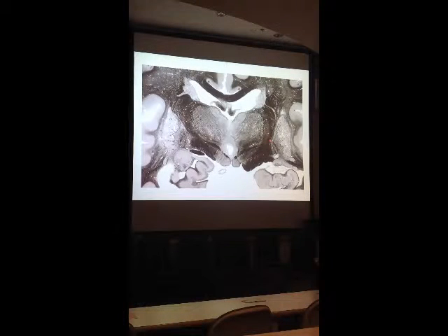So again, internal capsule. Remember, lateral to the internal capsule are some important nuclear territories that are part of a motor control circuit, but also there are neurons here that play a role in addictions and seeking pleasure and things like that, which we did not talk about. The lateral part of this nuclear territory is made up of the putamen and the inner bands here. In the human brain, there are usually three bands, 1, 2, 3, of neurons that make up the globus pallidus. So we see putamen and globus pallidus. Superficial to that, you see the cortex of the insula, and the lateral sulcus is the outermost territory.